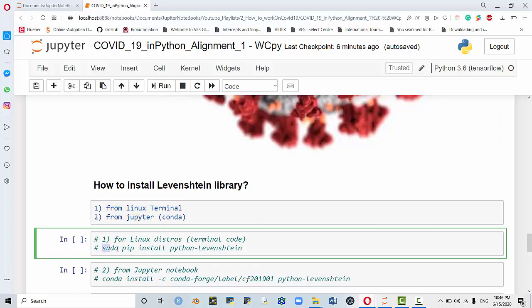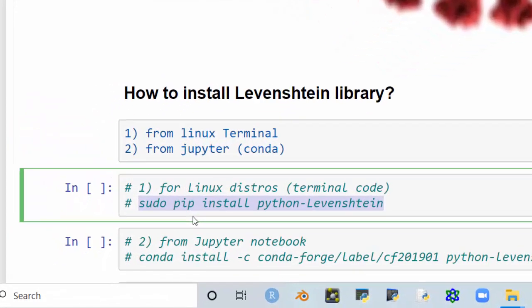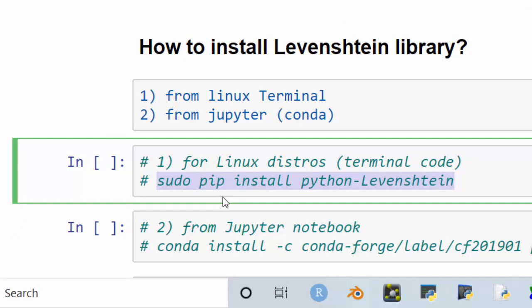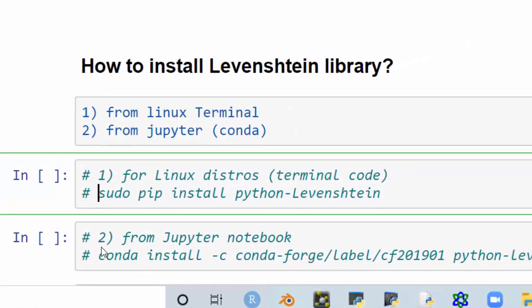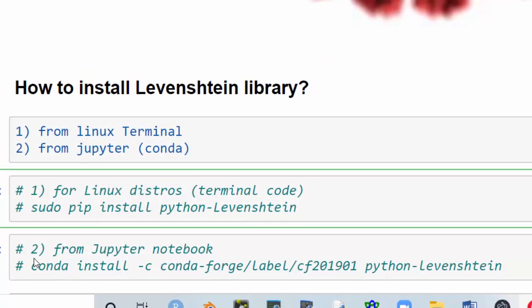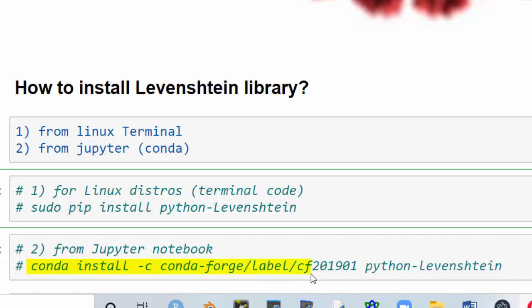The code for Linux terminal is sudo pip install python-Levenshtein. Navigate to this one, if you can't see it I'm going to zoom it in, and it automatically installs it for you. If you'd like to use it from Jupyter, you can use conda install -c conda-forge/label/cf201901 python-Levenshtein. This will install it in your Jupyter notebook.